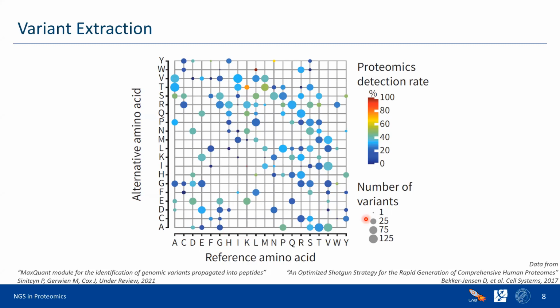This information can be found from the size of the circle, and you see that it's totally not uniform. There are probably two reasons. First, we don't have a uniform distribution of frequencies of different amino acids, that's for sure. But also there are the physical and chemical properties of amino acids.